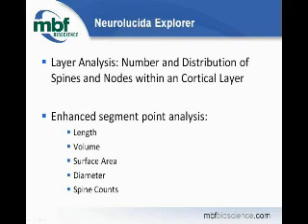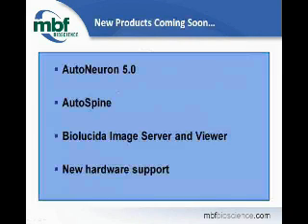Paul gave the wiggling jello analogy about how software is actually built. That's a good story. As soon as version 10 solidifies and we stop poking it, we're going to hit it with a couple of other things that are probably more than pokes, some rather sizable slaps up along the side of the jello. We have a number of things coming on the horizon that will not be part of version 10 but are coming later. We just wanted to put these on your radar screen so that if you're looking for this type of functionality, you know we are working on it.